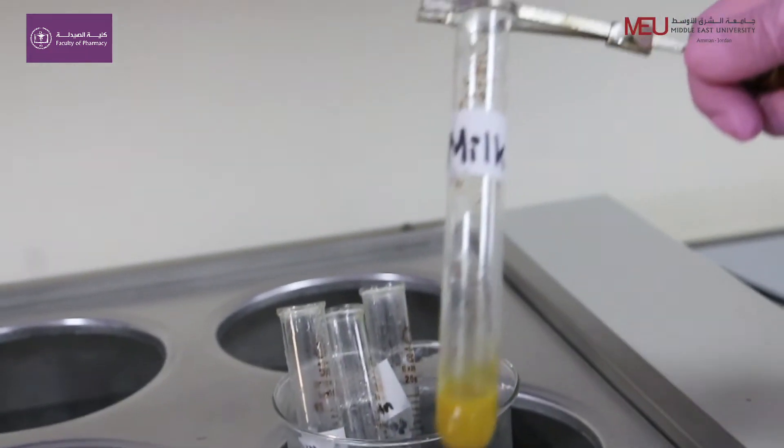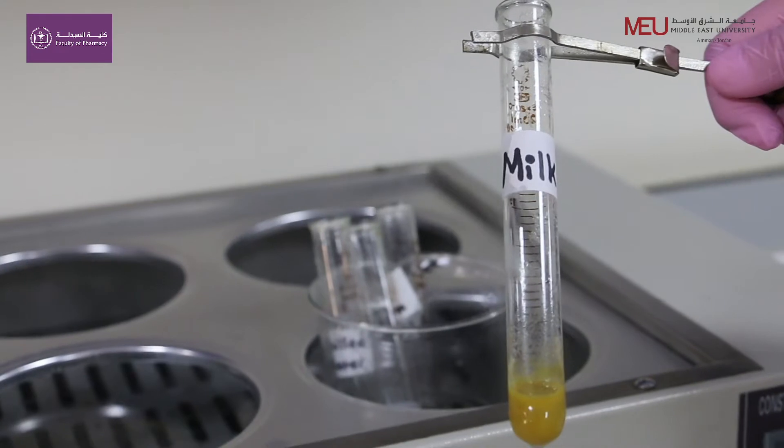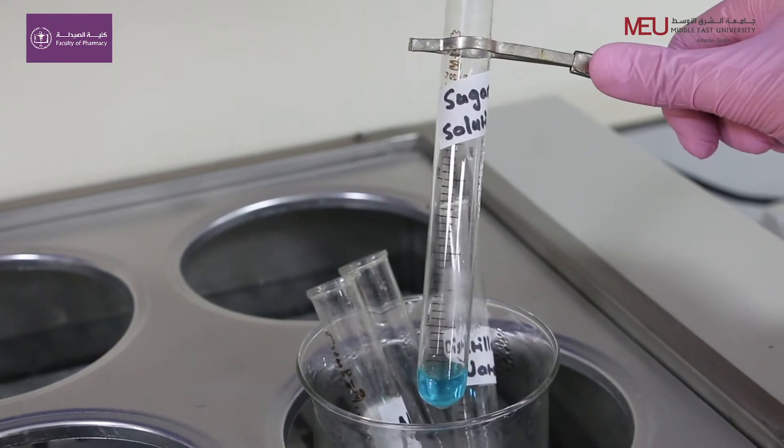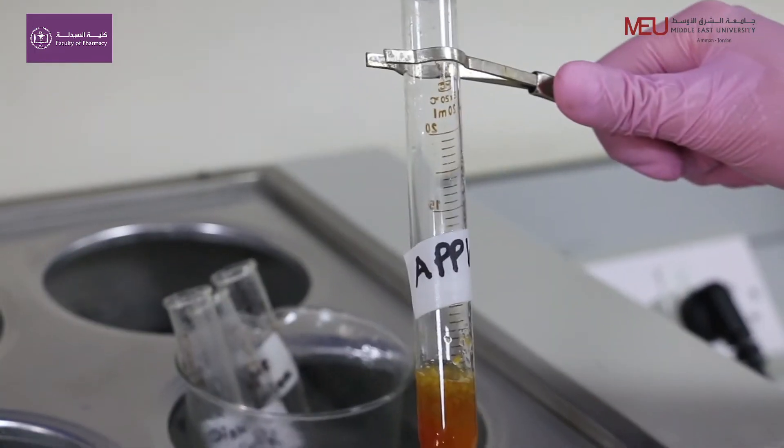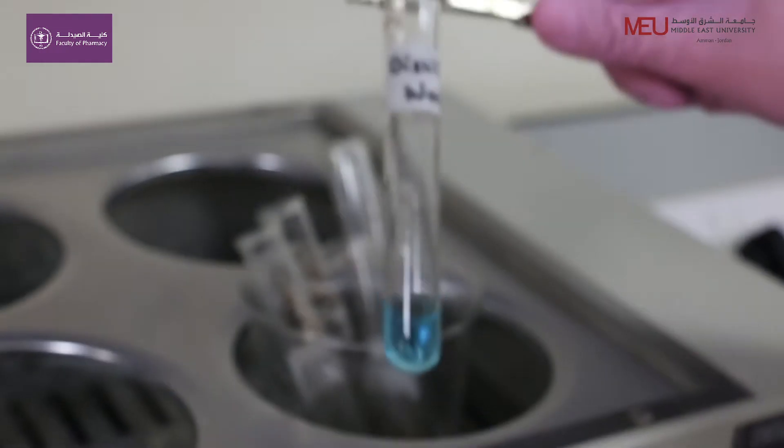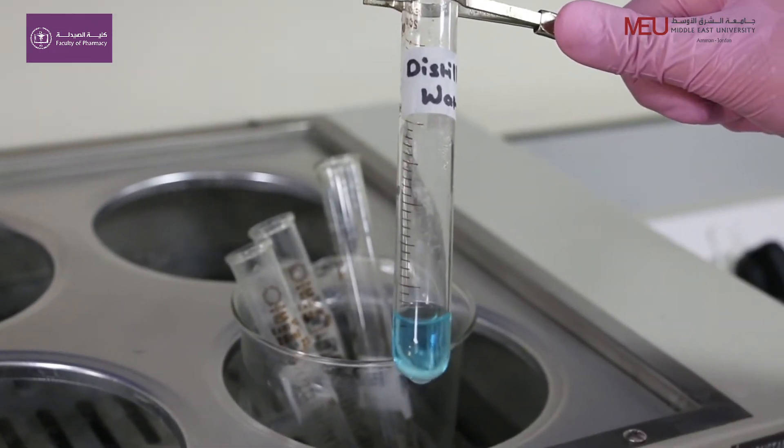The Benedict test identifies reducing sugars based on their ability to turn the blue copper ions in Benedict's solution to a yellowish-red color.